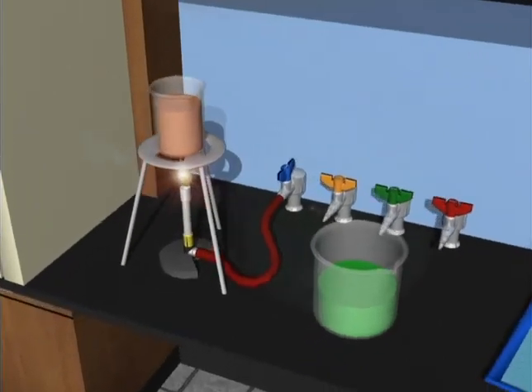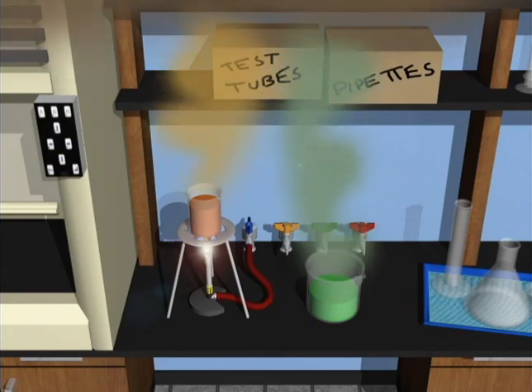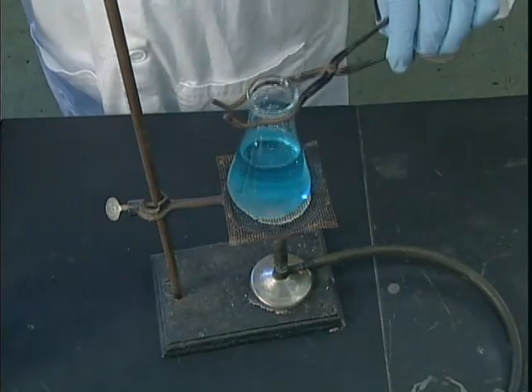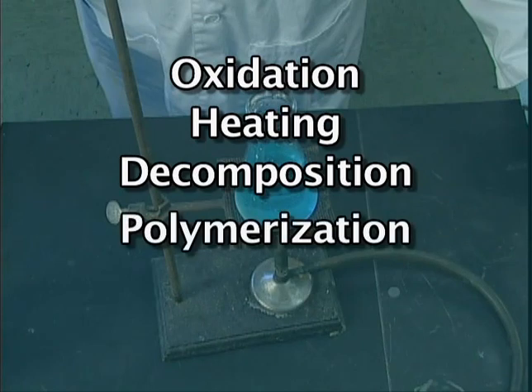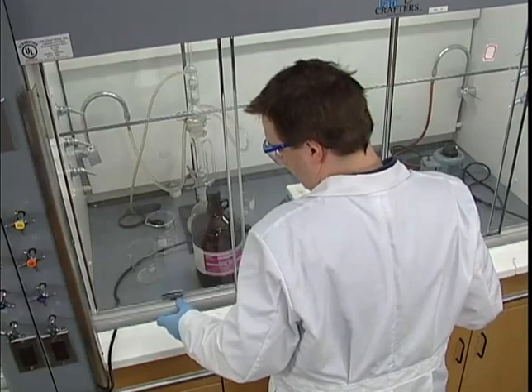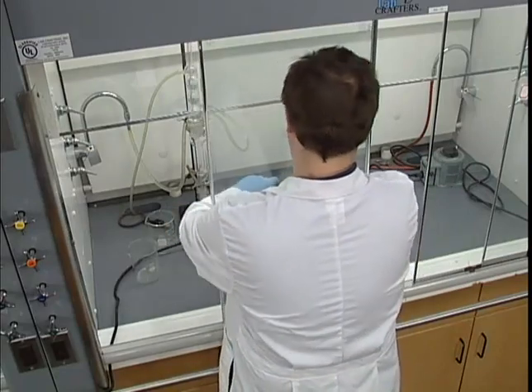If the material might react with another substance to create a hazardous situation, such as poisonous vapors, a fire, or an explosion, this incompatibility will be listed as well. This section of the SDS also addresses any hazards that could be produced as a result of oxidation, heating, decomposition, polymerization, or other chemical reactions. Remember, Sections 7, 8, 9, and 10 provide the information necessary to prevent hazardous situations from occurring.